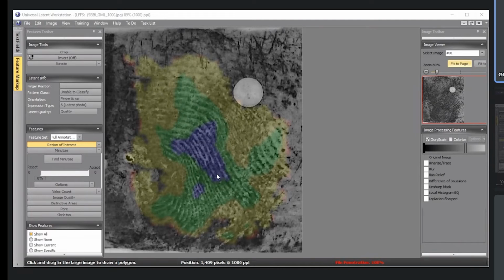Usually I find that if it scores a 30, they tend to be identifiable impressions. 20s are more marginal, but if you get a 30 or a 40 for a latent fingerprint, it tends to be identifiable. And to be clear, this is the clarity score, not the LQM, the actual latent quality metric. Great point. What's that score? That is a 51. Which is okay for a finger. Definitely seen higher, but that makes sense for this one here.